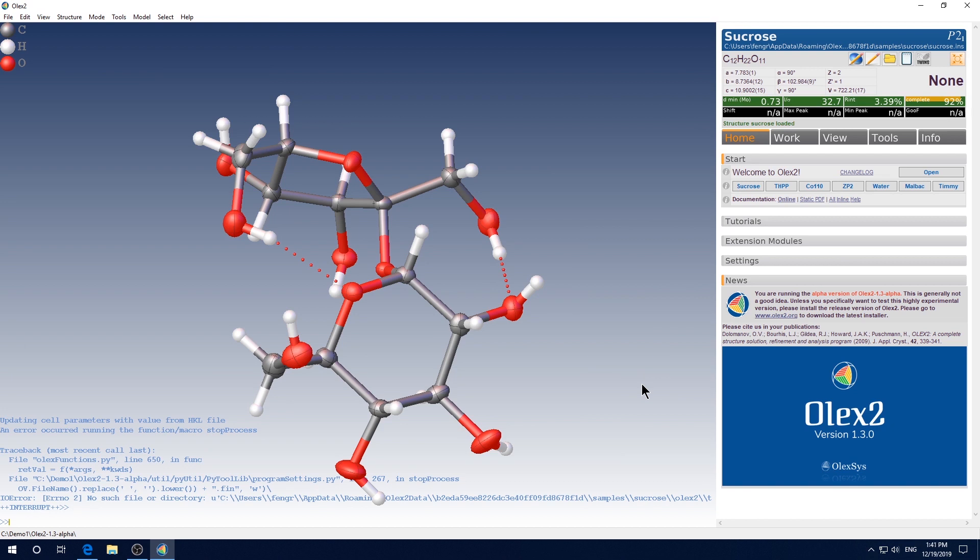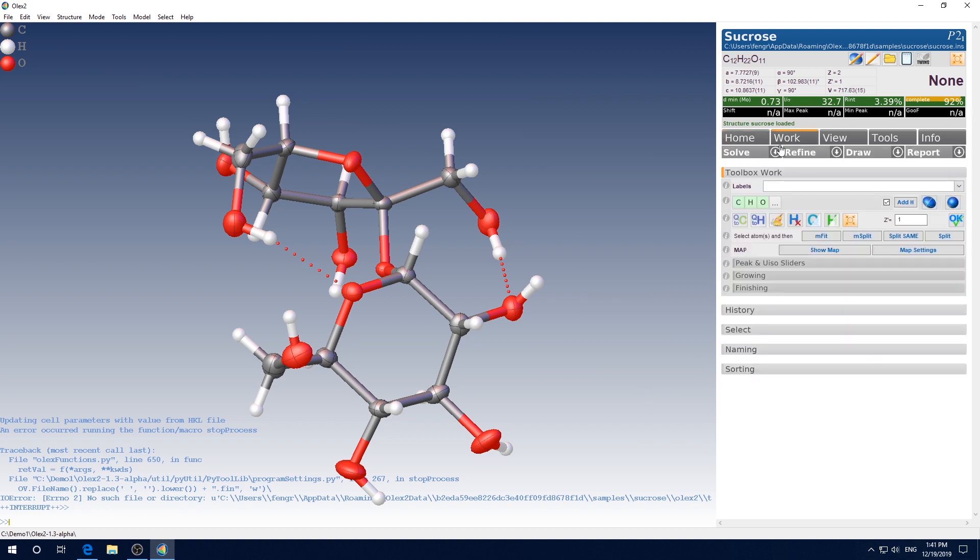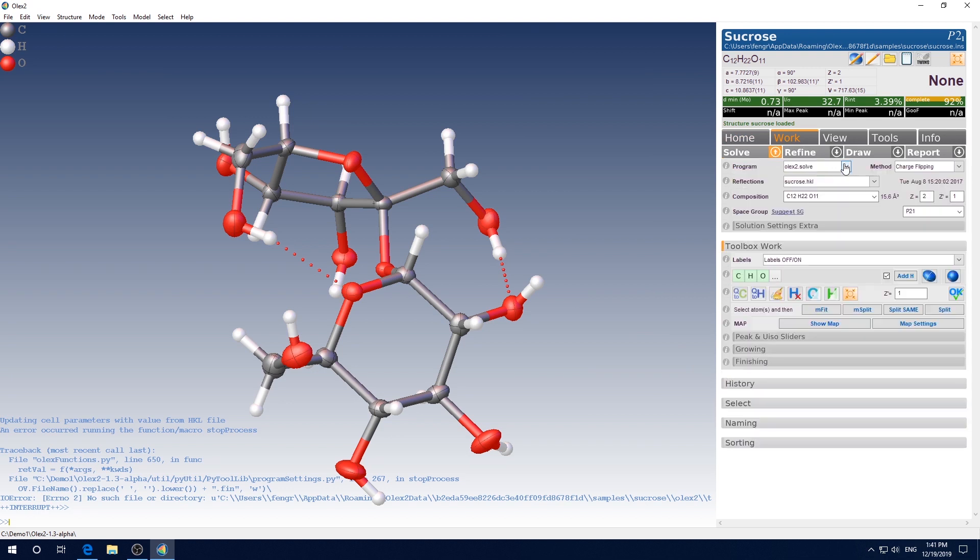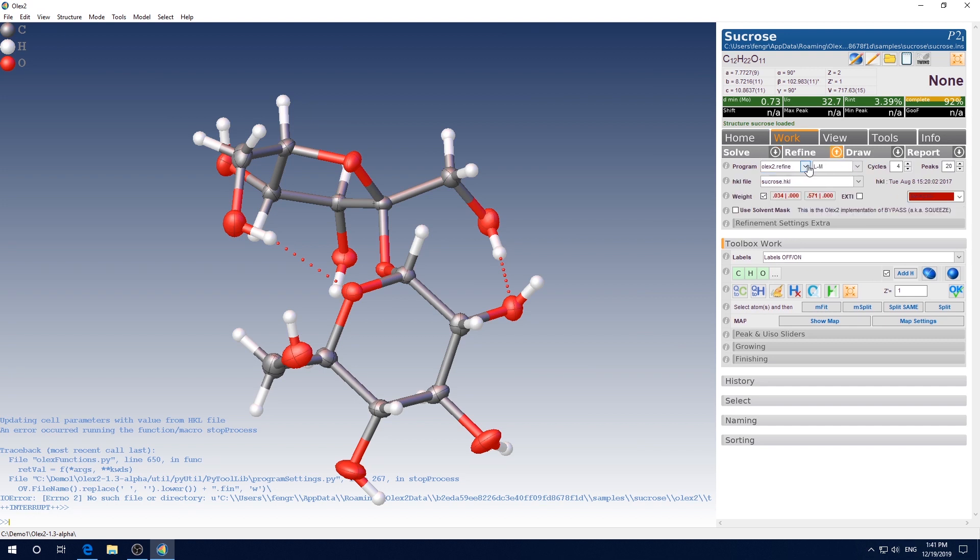However, I have to say that the installation is not officially done yet. Let me explain to you what I mean. If you click work, click the arrow by solve, click the drop down arrow here. You will see you only have one option, which is Olex2.Solve. Similarly, if you click the arrow by refine, you also only have one option here.